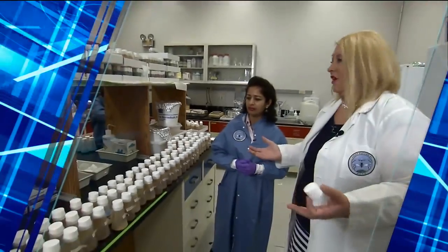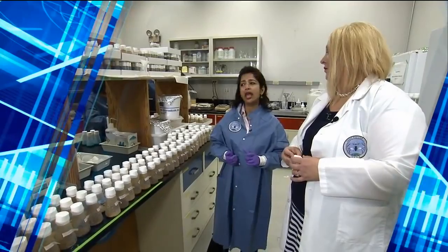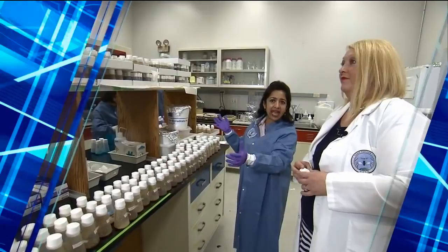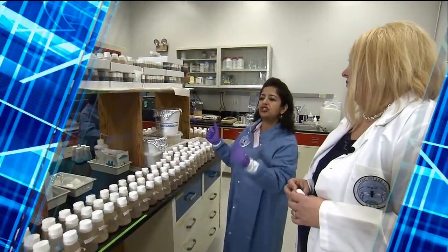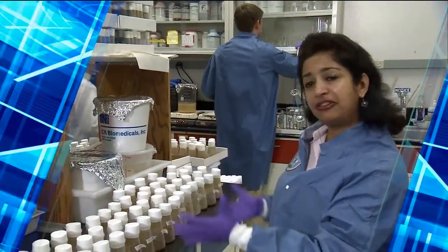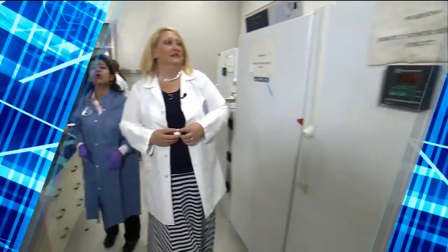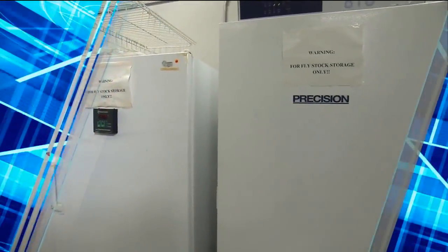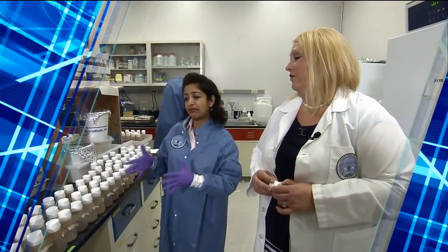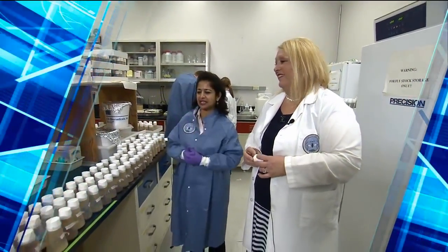So we grow flies here all the time? We do. In fact, we have to have a continual stock going. And so all of these, you can tell this would be too much work to do all in one day. So basically the way we do it is, folks in the lab on a weekly basis have to feed. And mind you, what you're seeing here is only a subset. Inside these incubators, we have more flies as well. And so all of them need to be fed on a regular basis so they don't run out of food, and so that we're ready for space flight when we need to fly these flies up into space.